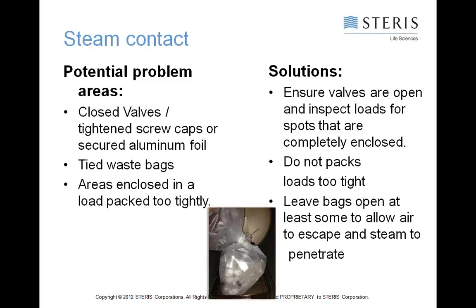So you actually can lengthen your cycle in doing that as well. And of course, if you've got the decom bags, at least leave some air allowed to escape and for steam to penetrate. If you can use a gentle vacuum, that is very helpful within this scenario. But I understand if you're autoclaving Petri dishes that were filled with agar, that can be problematic in a regular pre-vac cycle because they will boil over and you will have some flash evaporation and a mess to clean up in the autoclave when you're done.